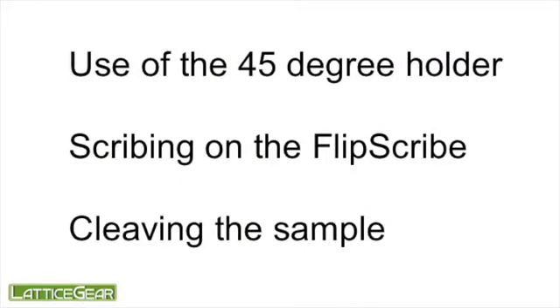In this video we will review the use of a 45 degree holder, scribing a sample on the flip scribe at 45 degrees, and cleaving the sample.